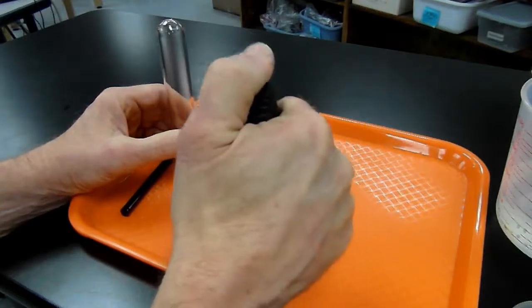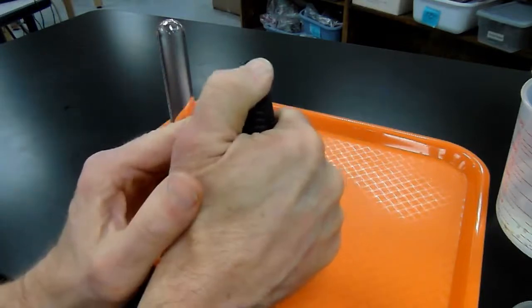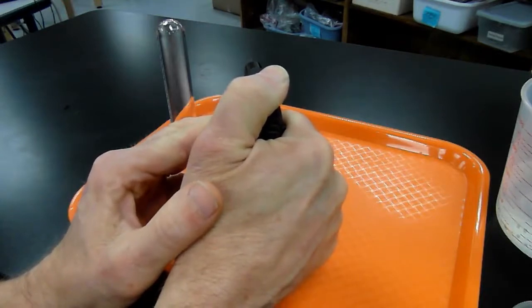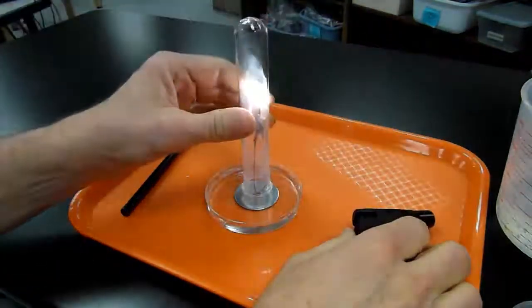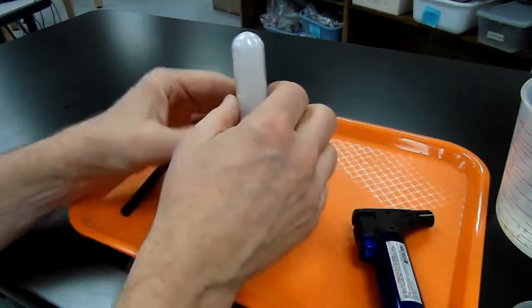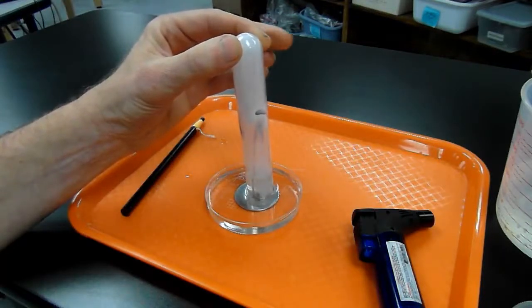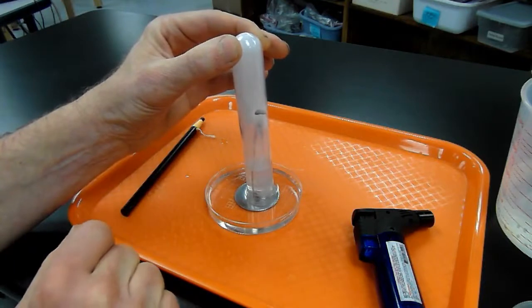My torch doesn't work as well as it used to. Almost. Come on. There we go. There's no real hurry here. I'm going to sort of slowly put it over. Let it burn. And then we do also need to let it sit for a while and cool down. And as you can see, at the bottom, the water is being drawn up into the test tube.